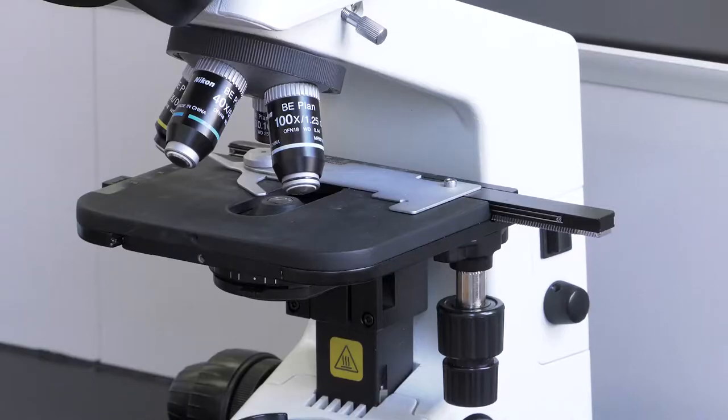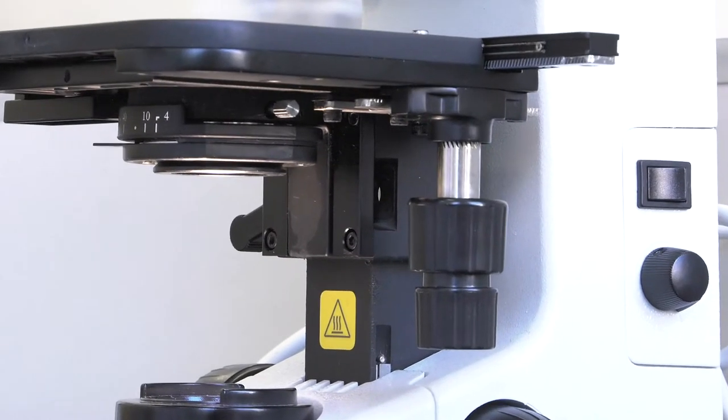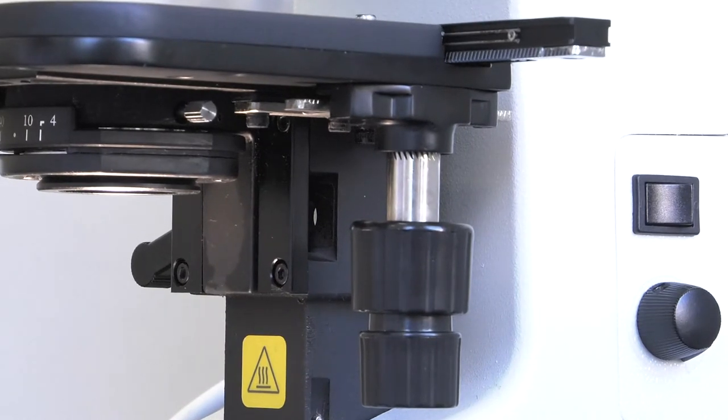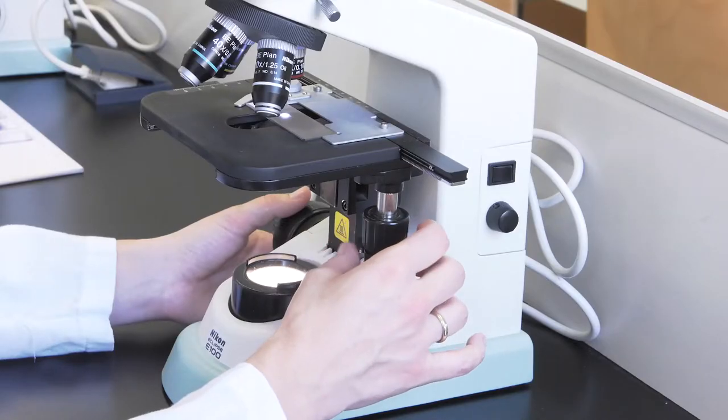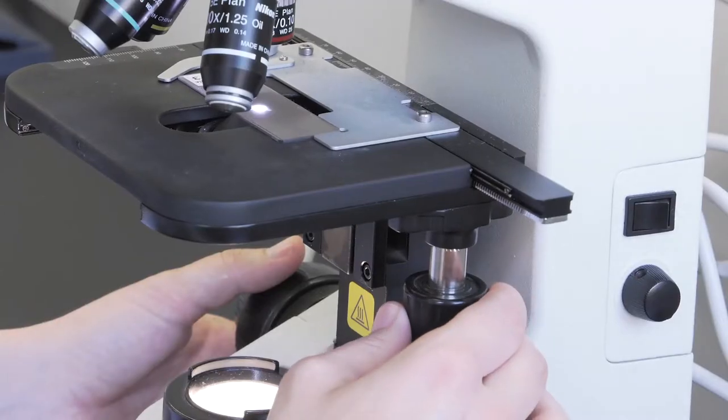The specimen holder is the metallic piece that holds the preparation and is also used to move it. On one side of the microscope, there are two knobs controlling X and Y movement of the mechanical stage. This allows us to place the preparation in the desired position.